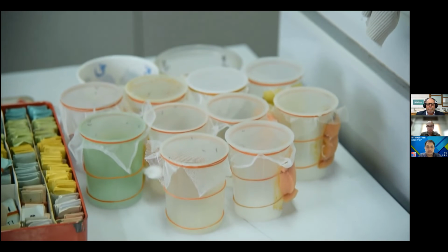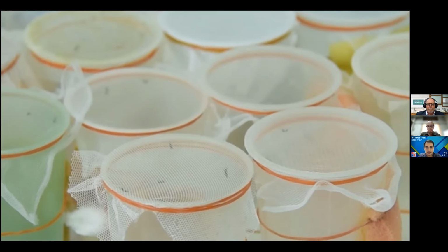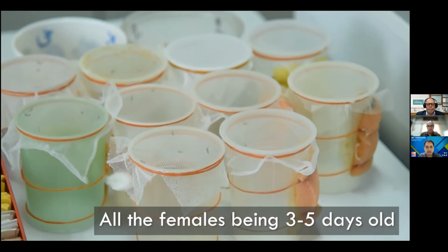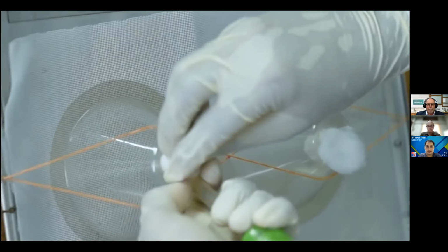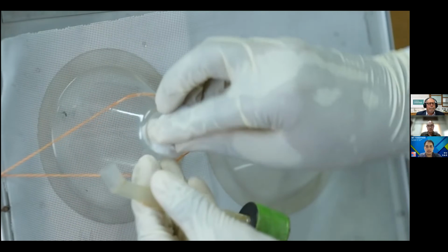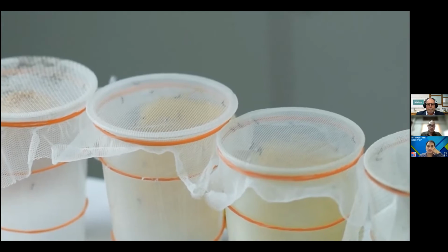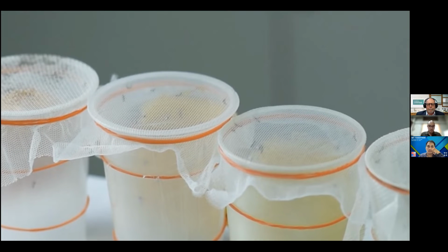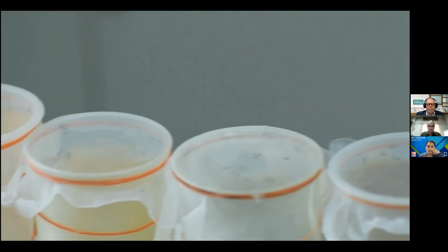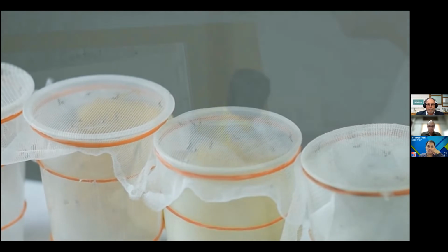Moving to preparation of mosquitoes, we use adult female Anopheles mosquitoes of a known fully insecticide susceptible strain, all the females being 3 to 5 days old. 5 mosquitoes are required for each replication and 10 series of assay repetitions are recommended. So in total, at least 50 mosquitoes are used per net. No sugar starvation is necessary, but mosquitoes should not have fed on blood before being used for these assays.